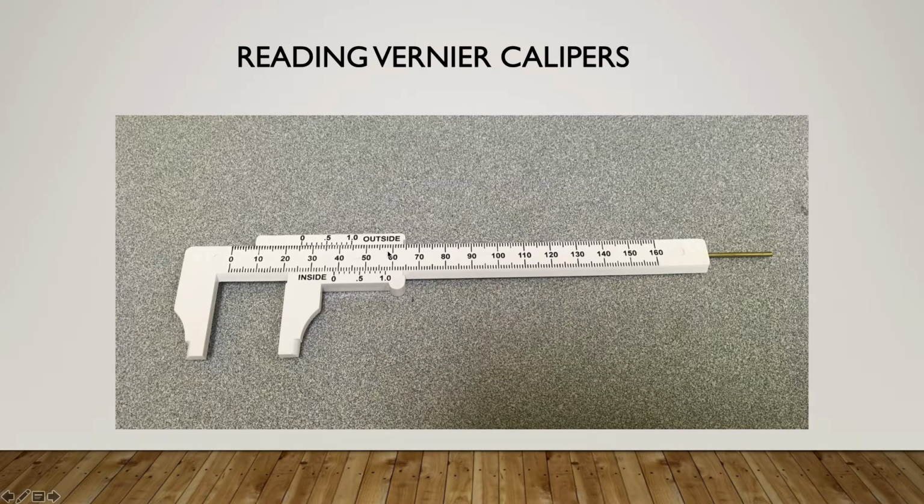in lab. And this top part and the bottom piece right here that I'm bouncing back and forth to with the mouse, that part slides on these calipers. You're going to take the pincher portion of the calipers and get a nice, firm, tight grip on whatever it is you're trying to measure. And then what you're going to do is read the calipers.